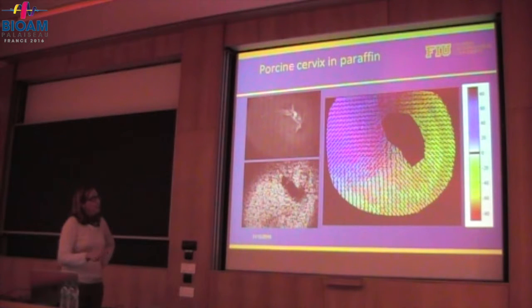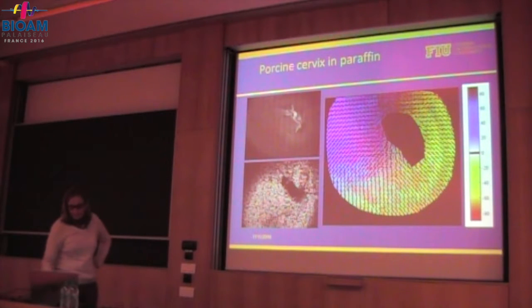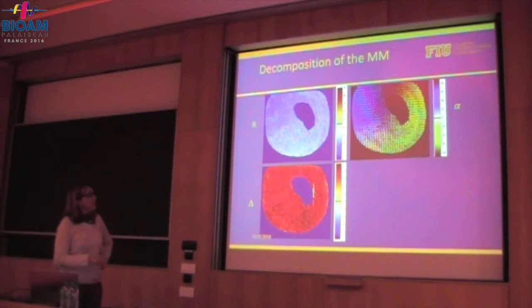If you go through the colors, you can see that we are going from yellow to blue, to purple, to red, and then back to yellow, right? So we span all the angles around this os. This doesn't look great here. I can show it on my computer later on if you're interested.